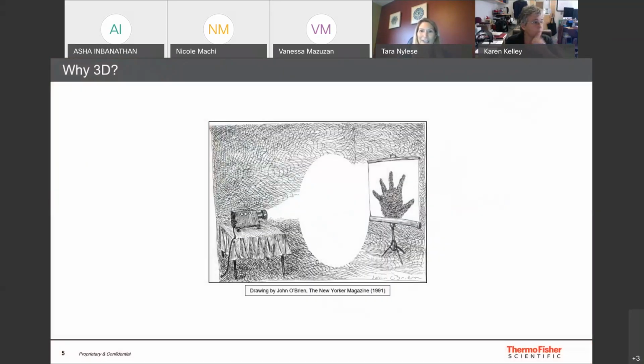As we get started, I'll talk a little bit about the rationale behind why we want to consider 3D electron microscopy. As many of you may know, by working with 2D electron microscopy or even 2D imaging itself, we're used to looking at a 2D image, a projection on a screen, or even a picture on our iPhones and our cameras.